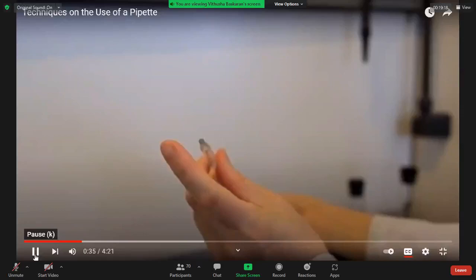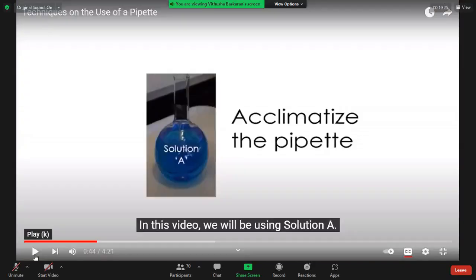Acclimatize the pipette. Acclimatizing the pipette means to rinse the pipette with the solution to be used. Before this, you have to rinse the pipette using distilled water or deionized water. After that only, you have to rinse the pipette using the solution which you are going to transfer.